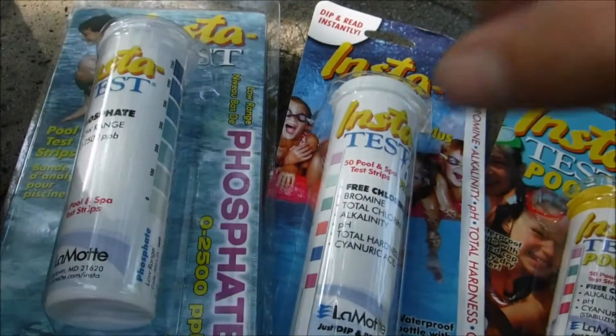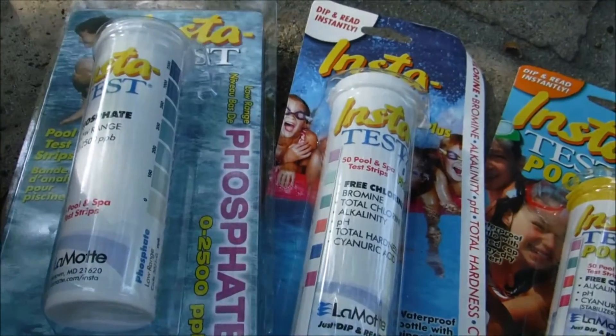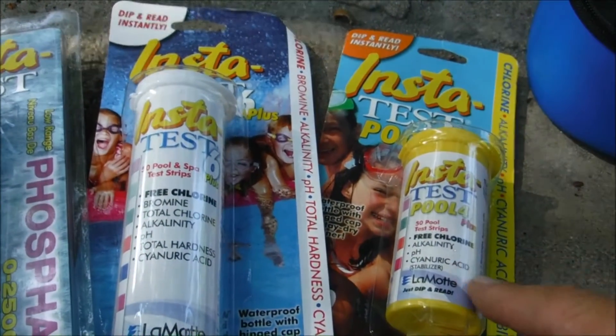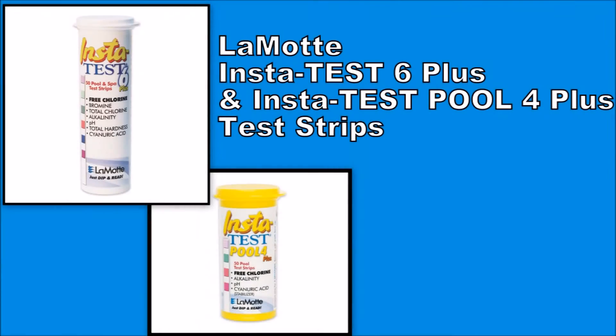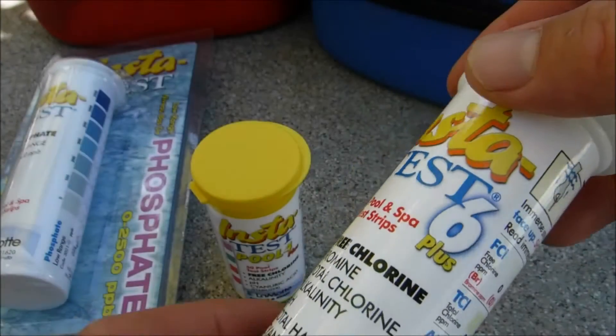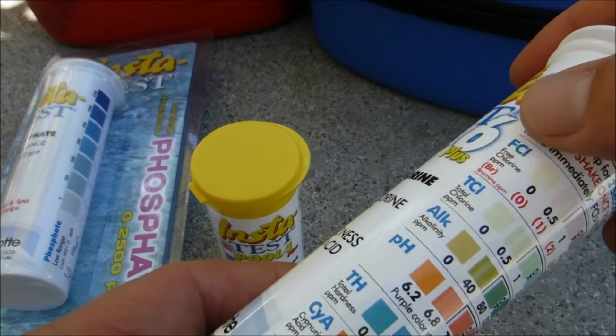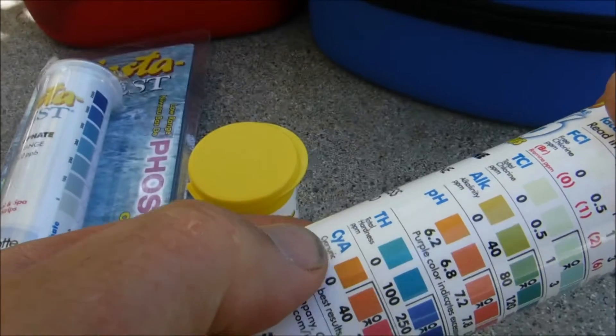Lamont makes a variety of test strips, including phosphate test strips, regular six-way test strips, and a four-way test strip. This is the Instatest 6 Plus. It tests for free chlorine, total chlorine, alkalinity, pH, total hardness, and cyanuric acid level.